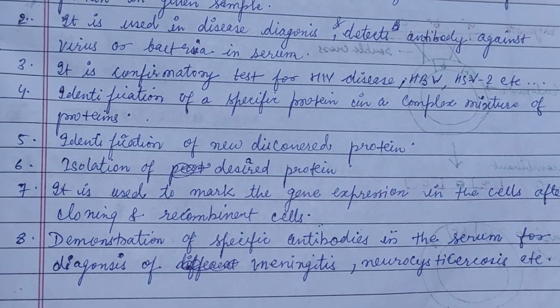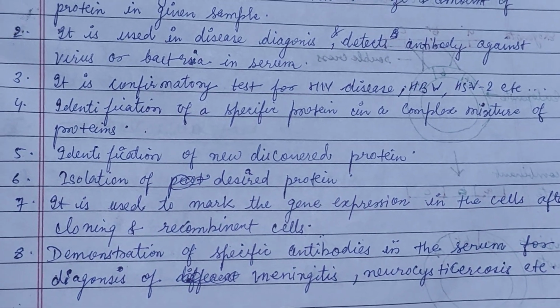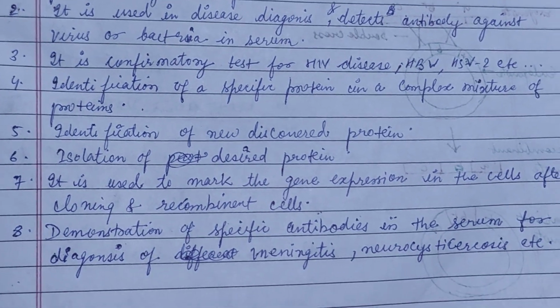So this is all about Western blotting, its types, methods, steps, principles, and processes.